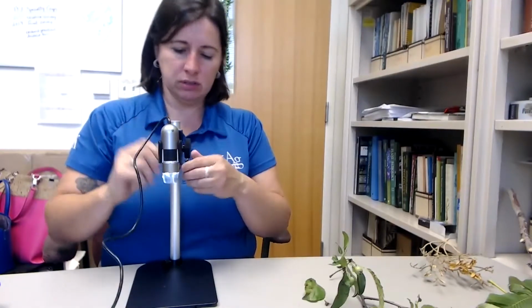All right, so my good stand. I had the DinoLite first in my hand, and I was using it this way. This is when I was shaking. Again, this is good if we're sharing screens, okay? If you're going to use the stand, the DinoLite just presses right in. This is the focus button. It just moves and turns. And then I can use this screw here and loosen, and then the shaft moves up and down. And then I tighten it, and there I have hands-free.